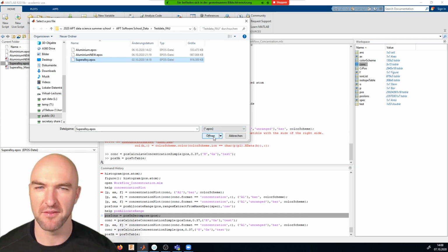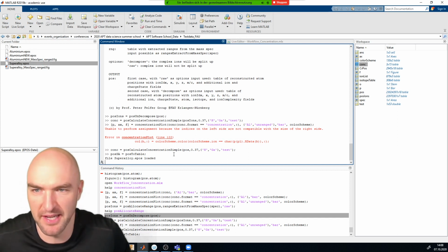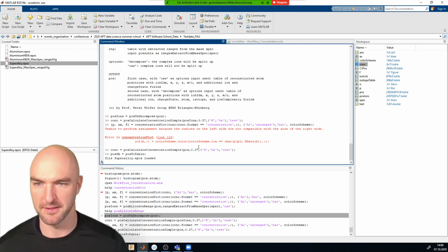Oh, and it's a very, very, very large data set. I hope we have clipped that one, because the original data set is something like 150 million atoms or something like that. It's relatively big, so it might take a couple of seconds to get that started. Okay, so it's 30 million atoms, so it's not super bad.